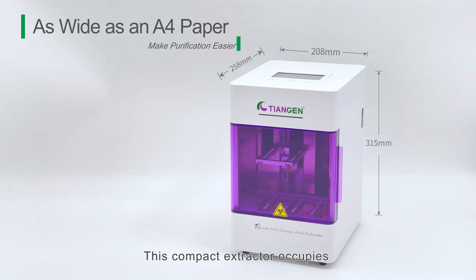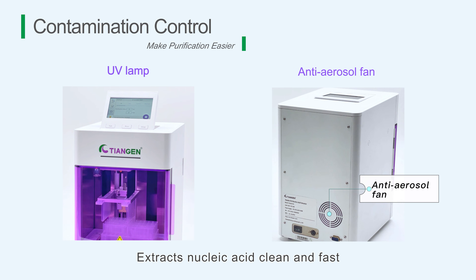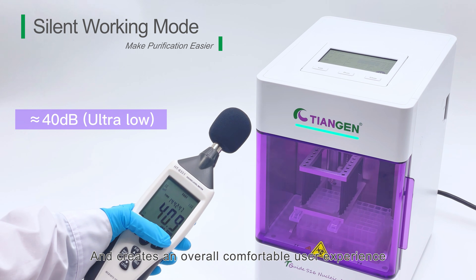This compact extractor occupies less space than a piece of A4 paper, extracts nucleic acid clean and fast, and creates an overall comfortable user experience.